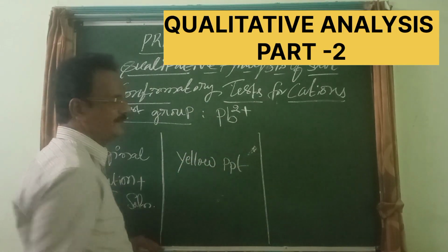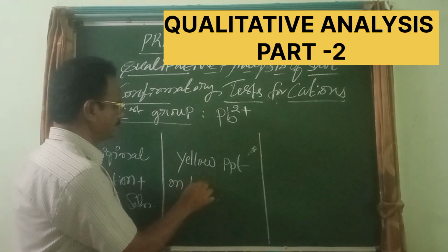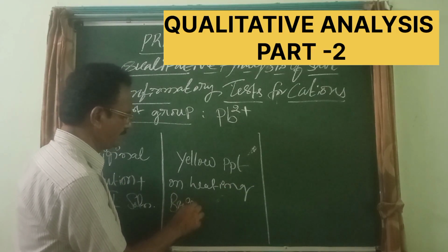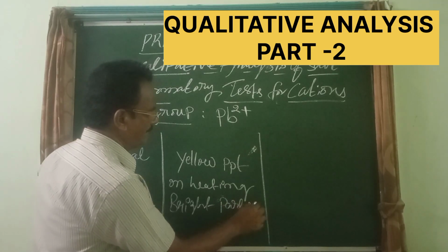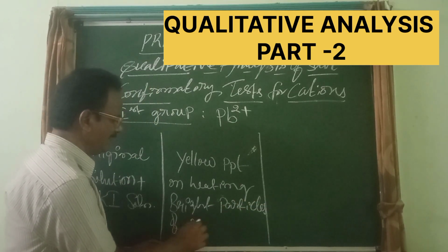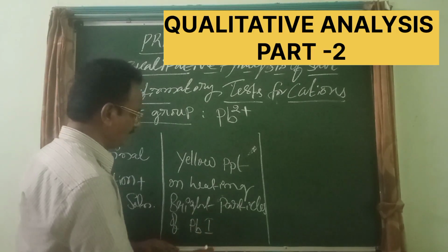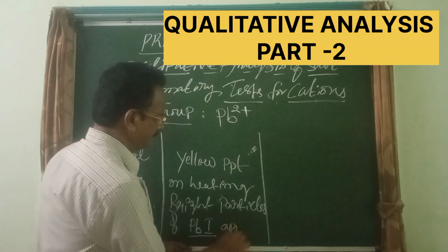On heating, keep in mind, bright particles of lead iodide, PbI2, appear.